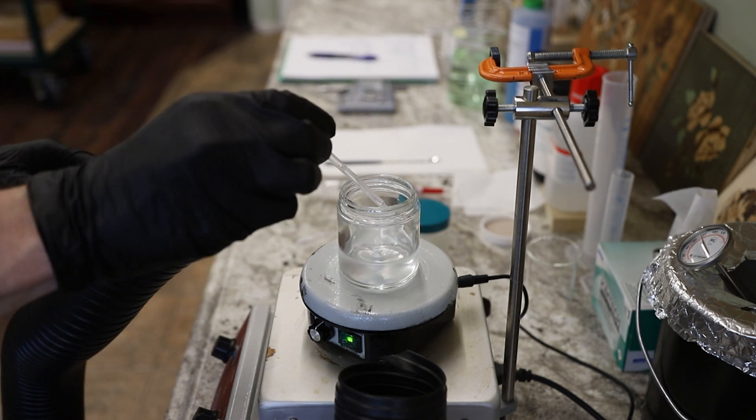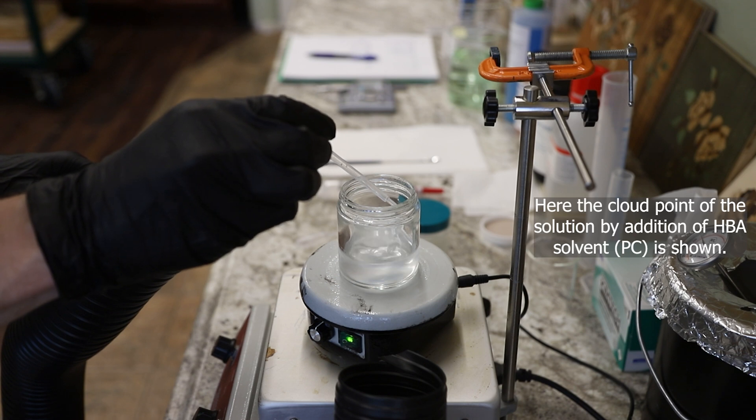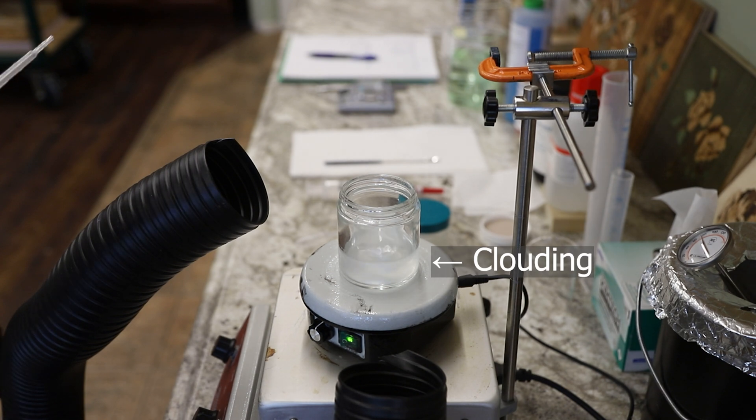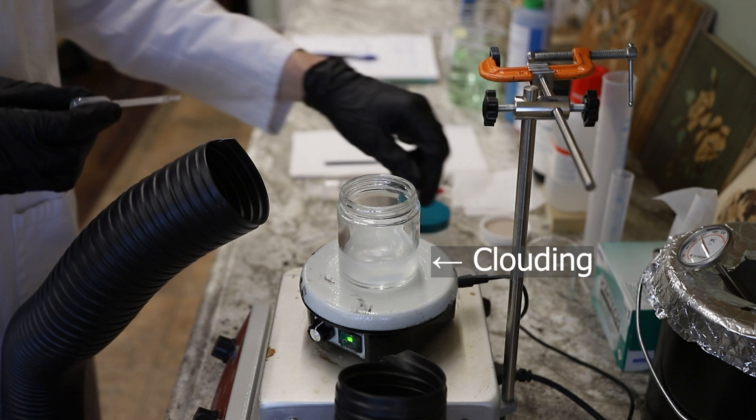So I've added, at this point, a little bit over 17 percent, because I'm going to demonstrate the cloud point. So here I'm adding slightly more, going up to about 18 or 19 percent propylene carbonate, and you can see that the solution is becoming opaque. This is the solution clouding.